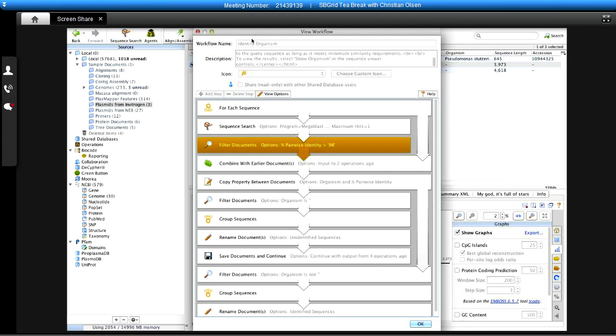And this is very handy because you can share workflows now with your collaborators. You can fork different steps within your workflow. So this is an aim to, again, make your work more efficient, to reduce the number of times you have to perform repetitive tasks. And the old adage is, if you have to click something or do something 3 times in a row, probably you need to look at automating that step.